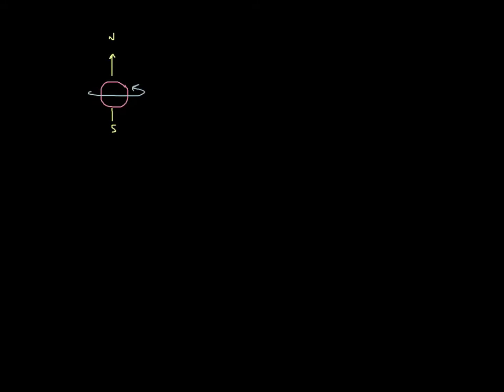All right, so in an NMR, what we do is we put all of these atoms that have an odd mass in our sample. We take them and we put them into a big magnet. So I'm just going to write this as a very big arrow. This is just a big magnetic field. Magnetic fields are labeled as B. So that's a big magnetic field, and all of these little guys line up. What we interpret for all of these little odd mass atoms is the environment that they're in.